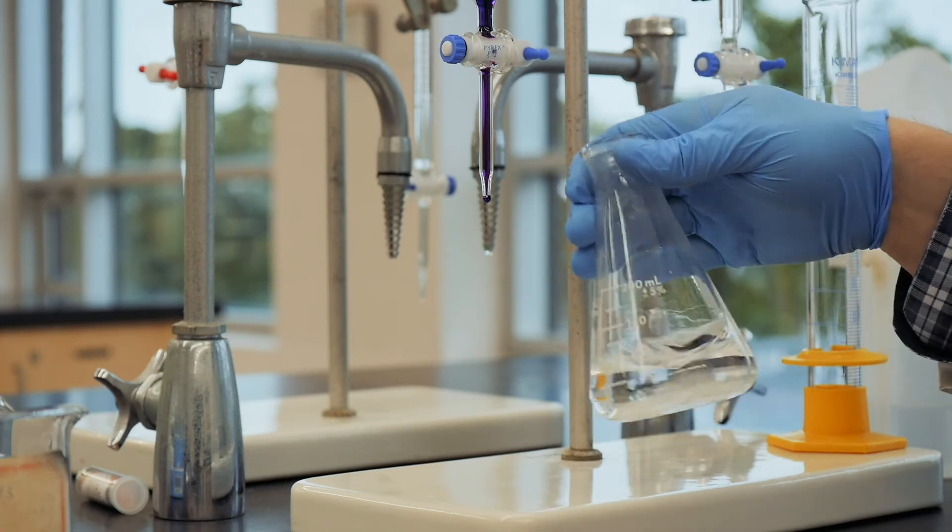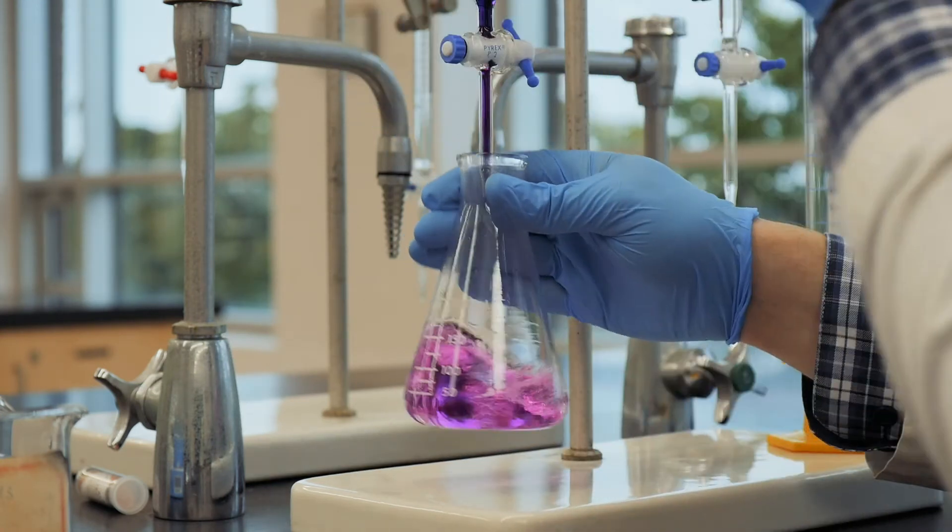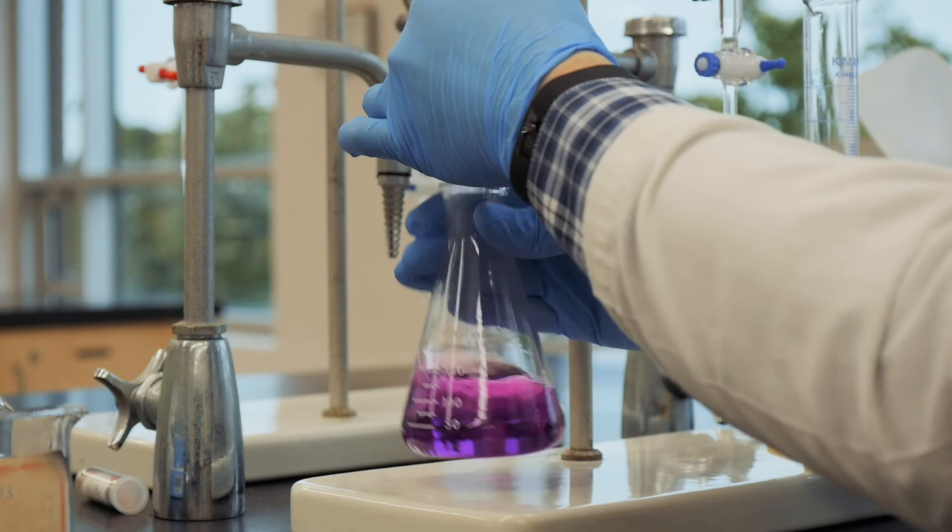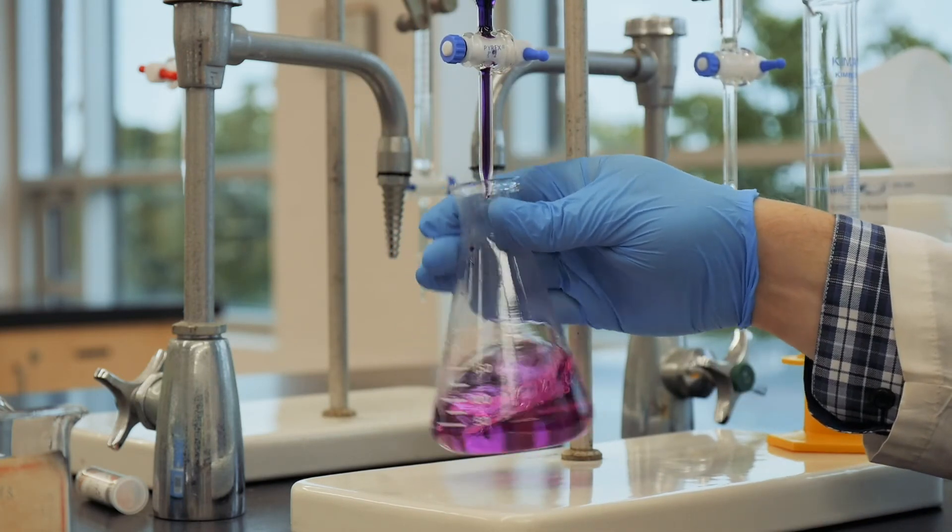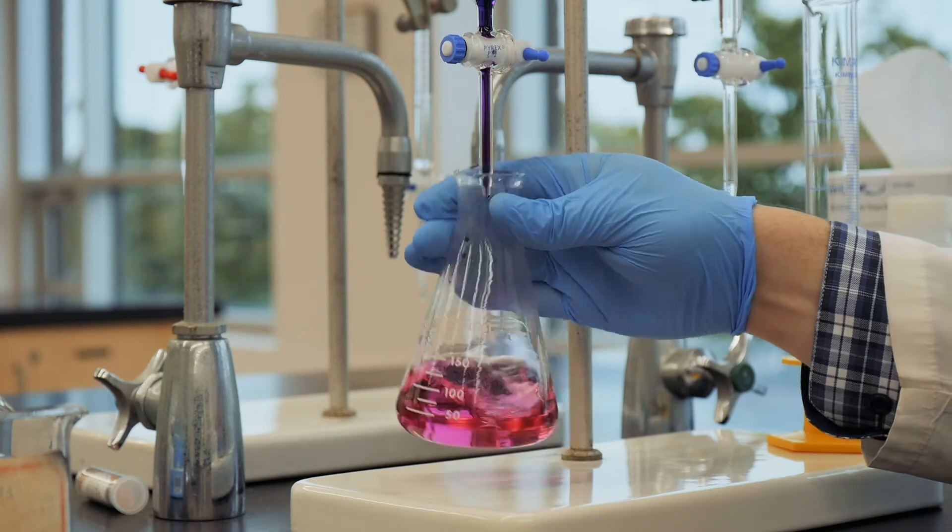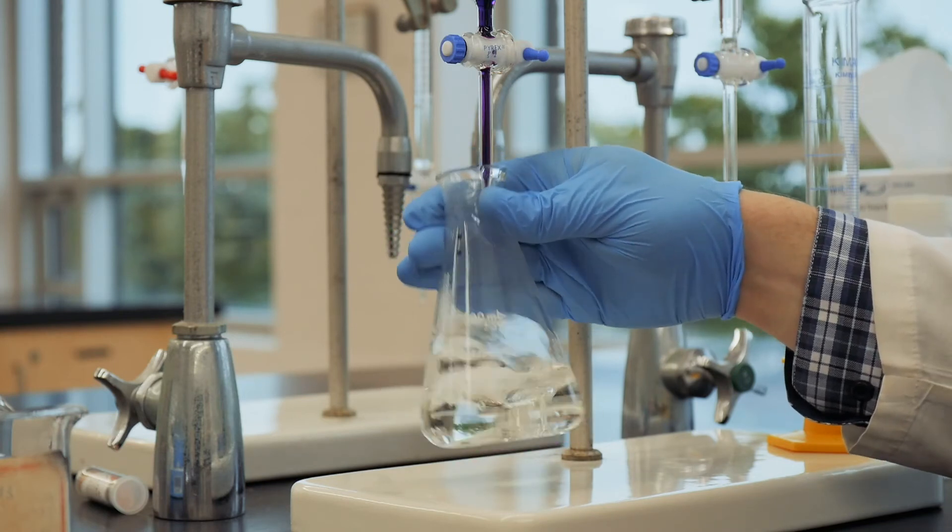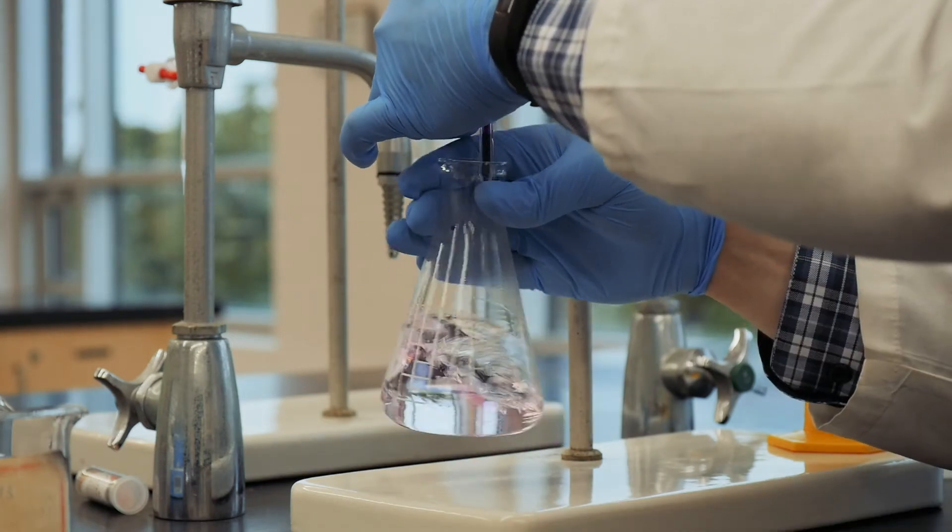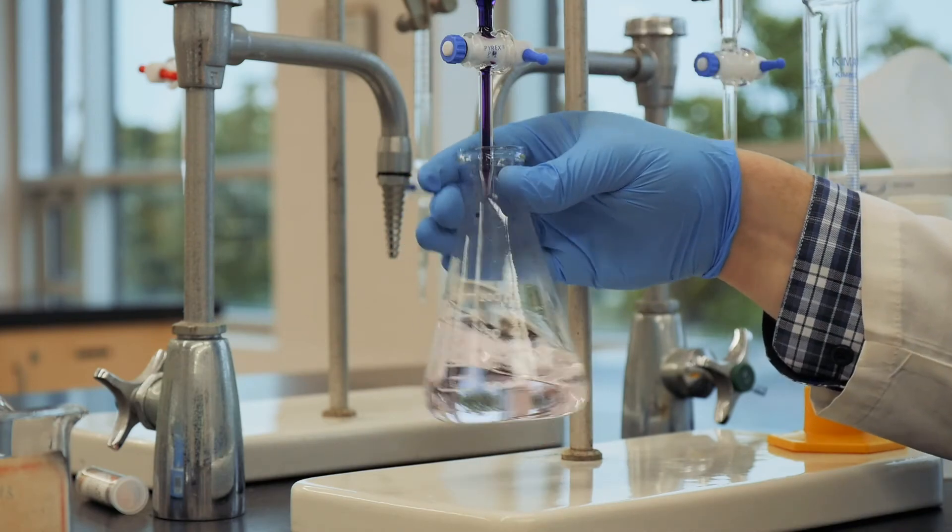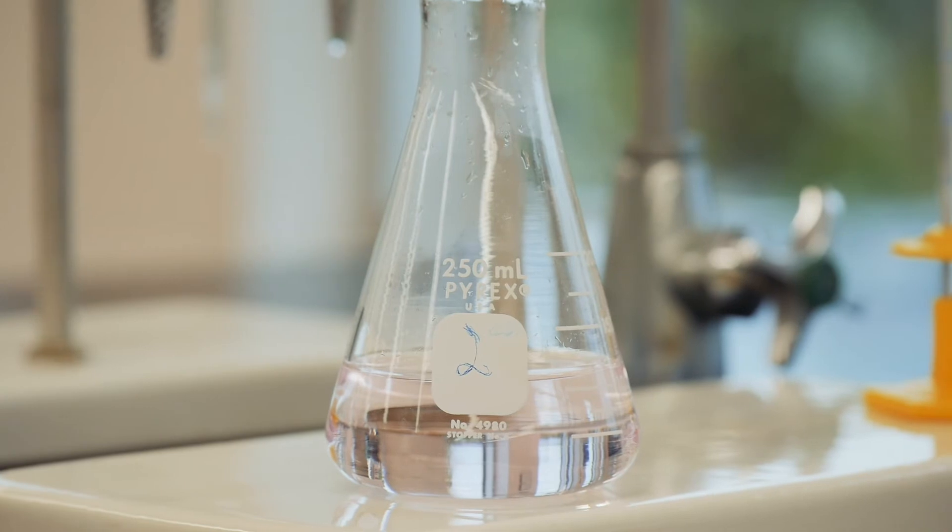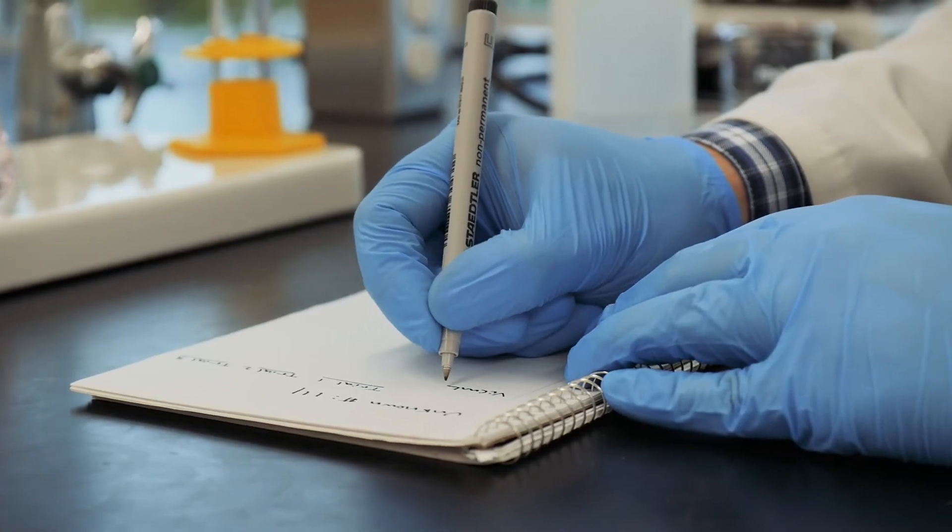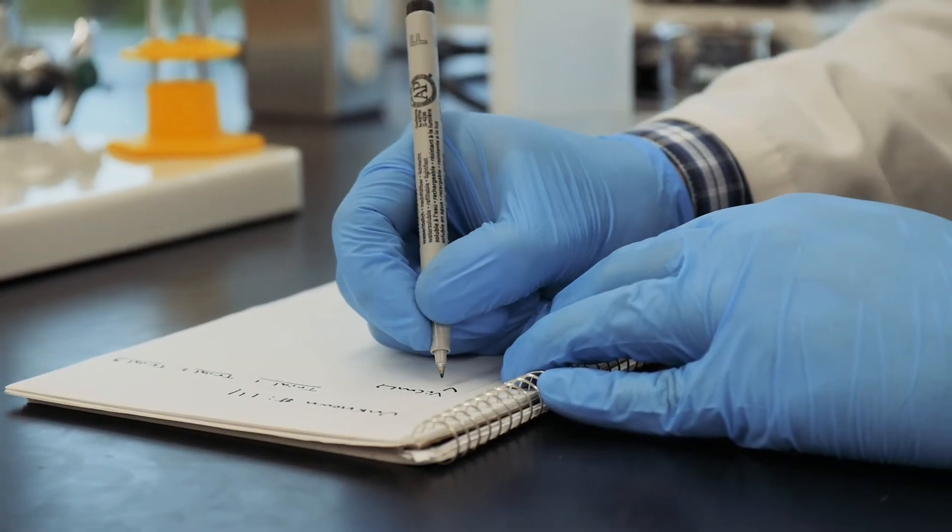If the solution doesn't become clear again, try reheating it to see if this helps. If it doesn't, unfortunately you'll have to start over. If the solution does become a clear solution again, you can then titrate at a quicker rate until the endpoint is getting near. You'll know you've reached the endpoint of the titration when you see just the first permanent pink tinge to the solution.